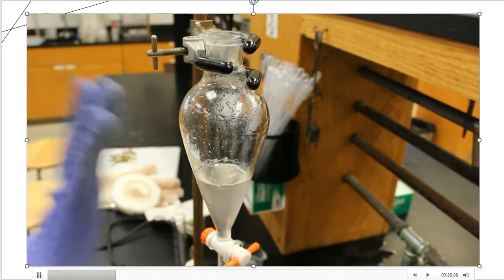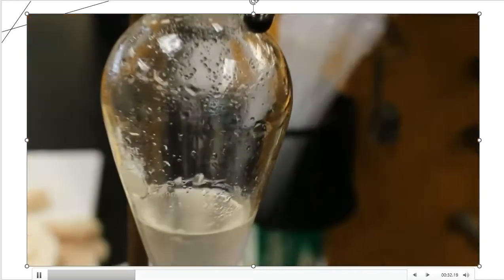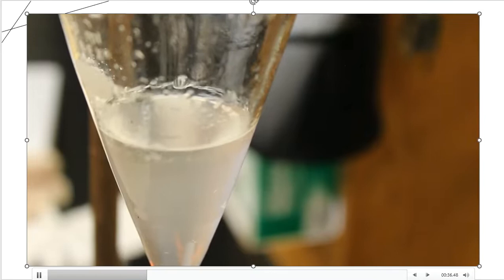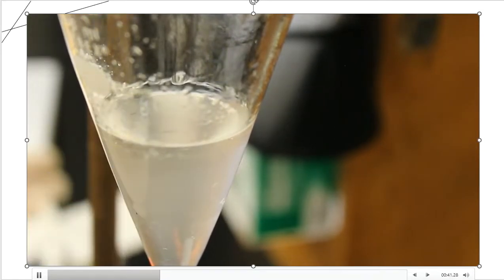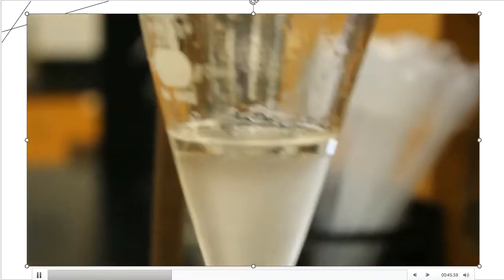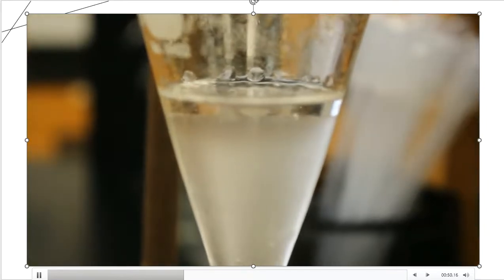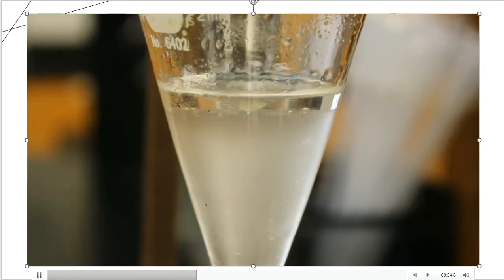All right, so there's my sodium hydroxide. 5 milliliters is not a lot, folks. On your screen, you could see a small layer that's forming on top. I don't know if you can really see that or not, but it's right here. However, if I lower this down, just bear with me, you might be able to see that a little bit better. All right. So this is the small addition of sodium hydroxide that I've just added to the separatory funnel.